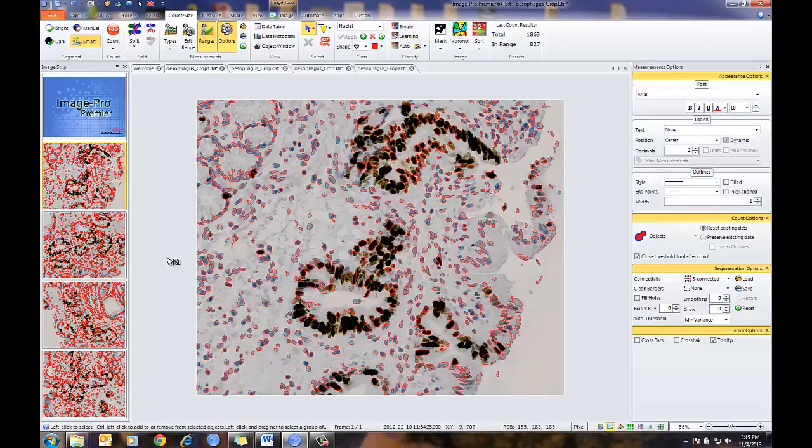set. One important thing here is I'm just building the set. This is not really the full analysis. Normally, in how this is set up and run, and using our new cell analysis app in Image-Pro Premier 9.1, I'll be counting the nuclei located in certain structures. But for the training set, I'm just going to select nuclei that are already represented within these structures, and then we'll apply those settings. So in this case, I have my nuclei already counted.